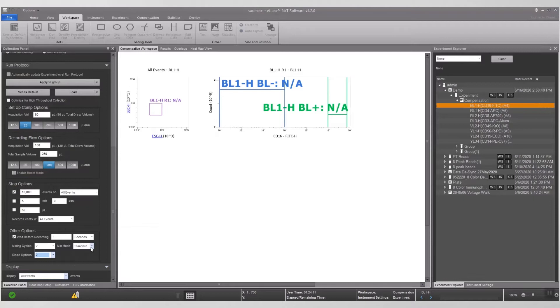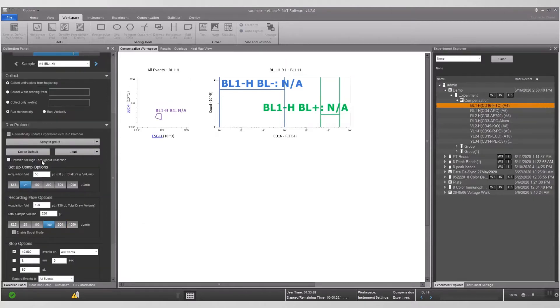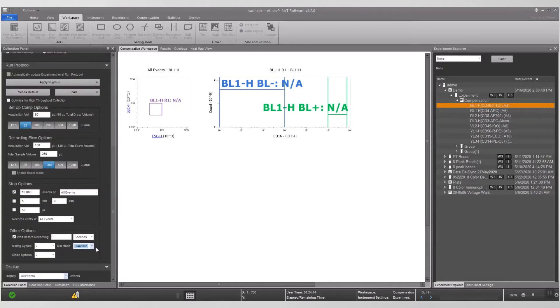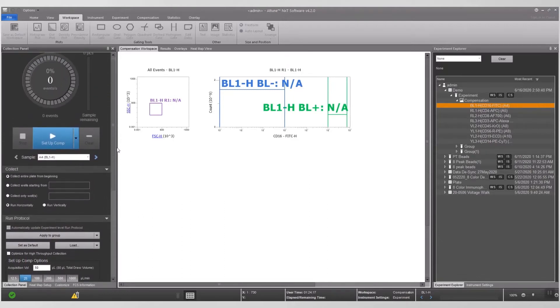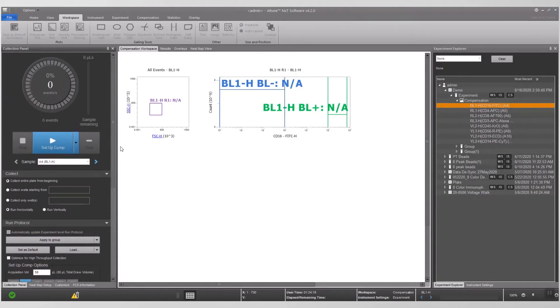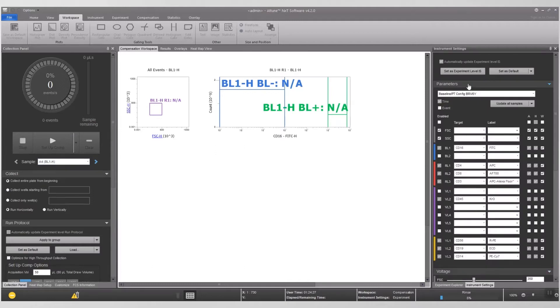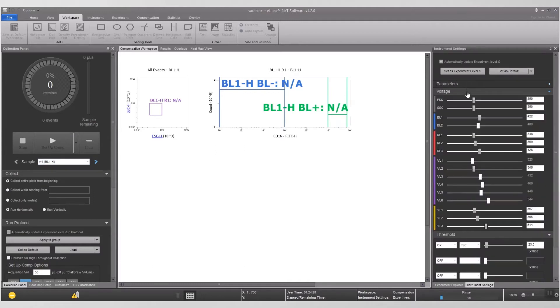There are two choices for mixing: standard or gentle. Click apply to group. Click setup comp to start acquiring the FITC control. To adjust the voltages, go back to the instrument settings tab and click on the voltage ribbon.